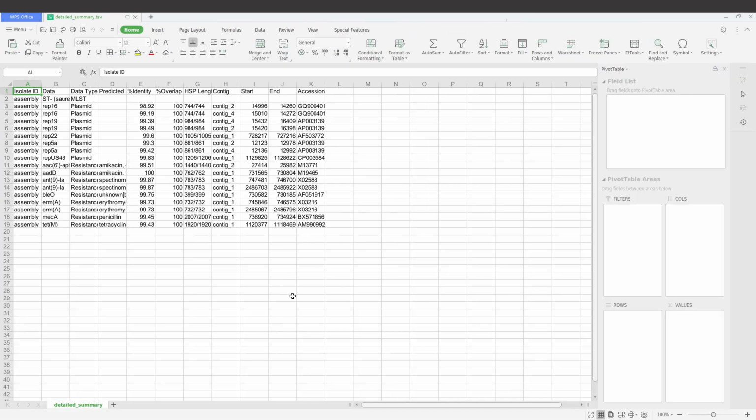We have some entries here. So what the tutorial hopes to achieve is that we select only records with identity values. So here you can see there's one here which doesn't have. So we need to get a command that will extract all these ones for us and then leave this one.